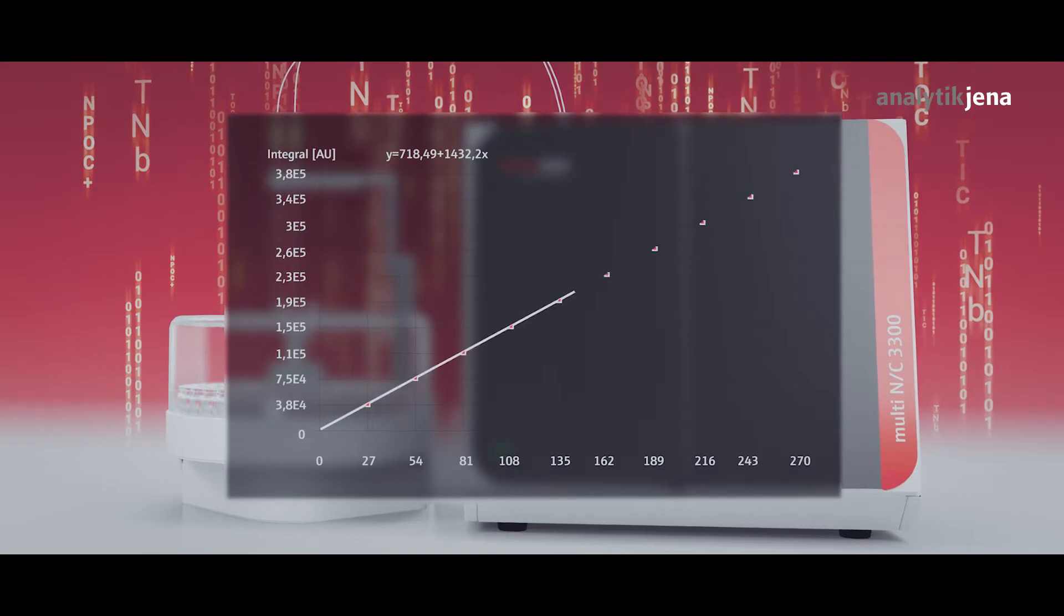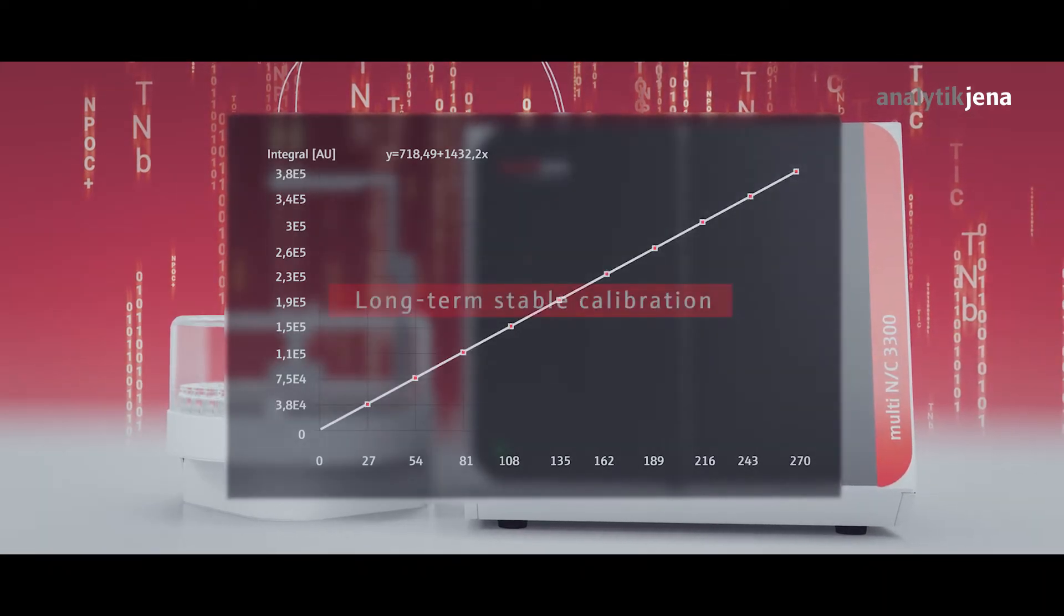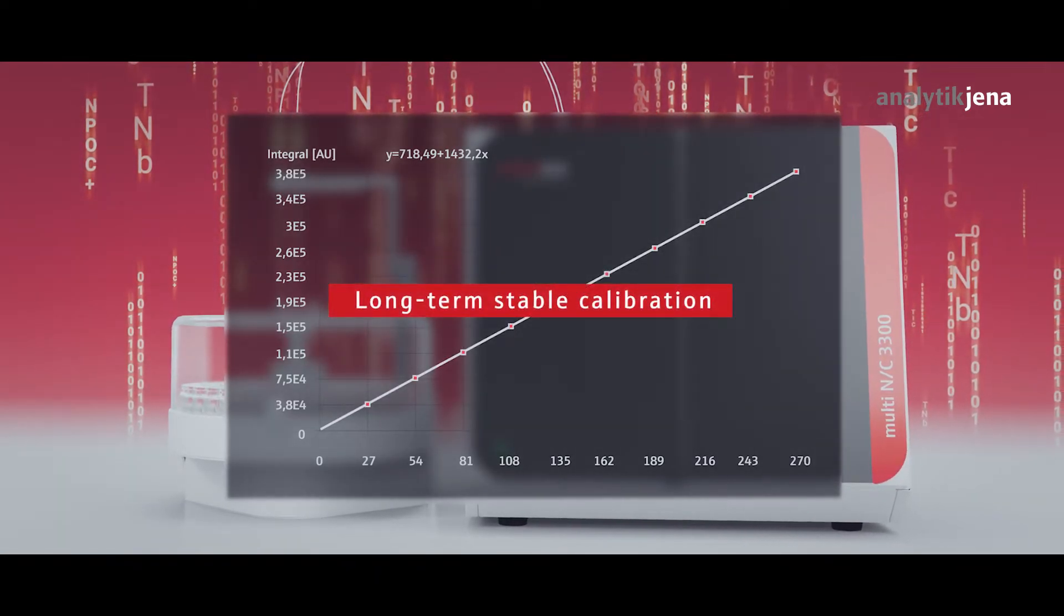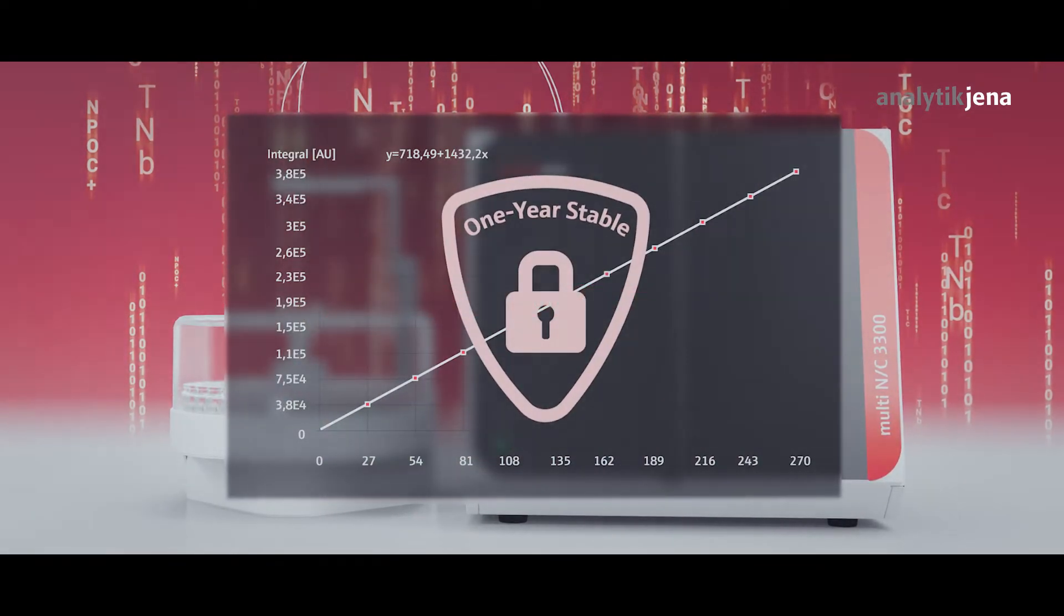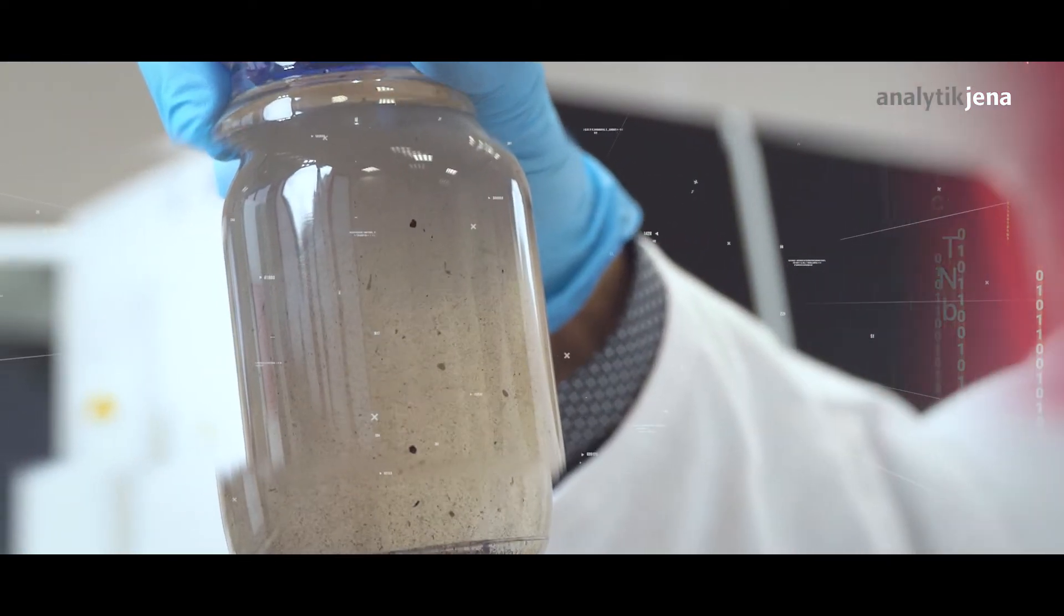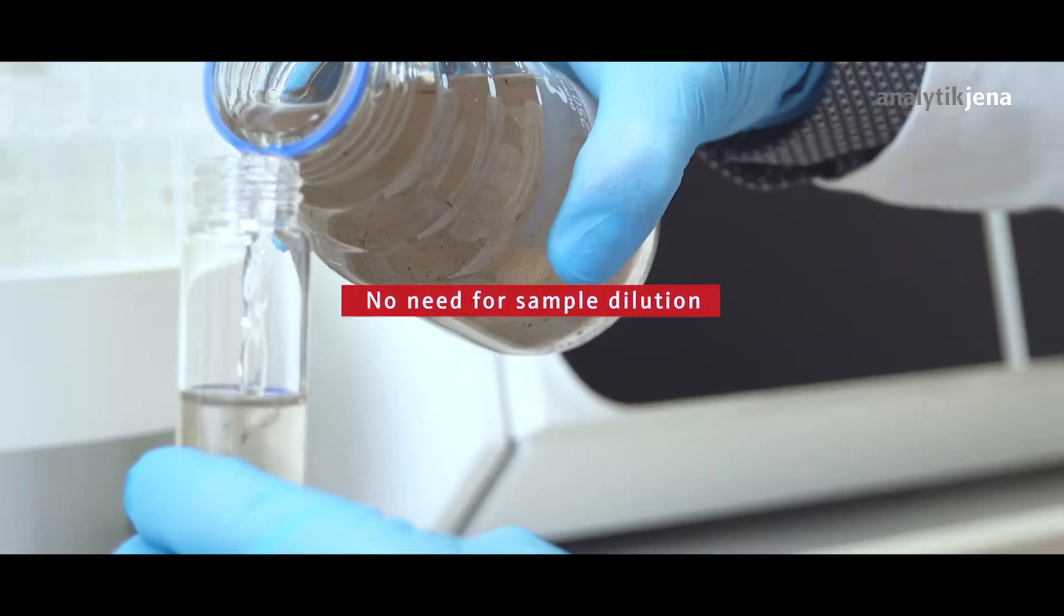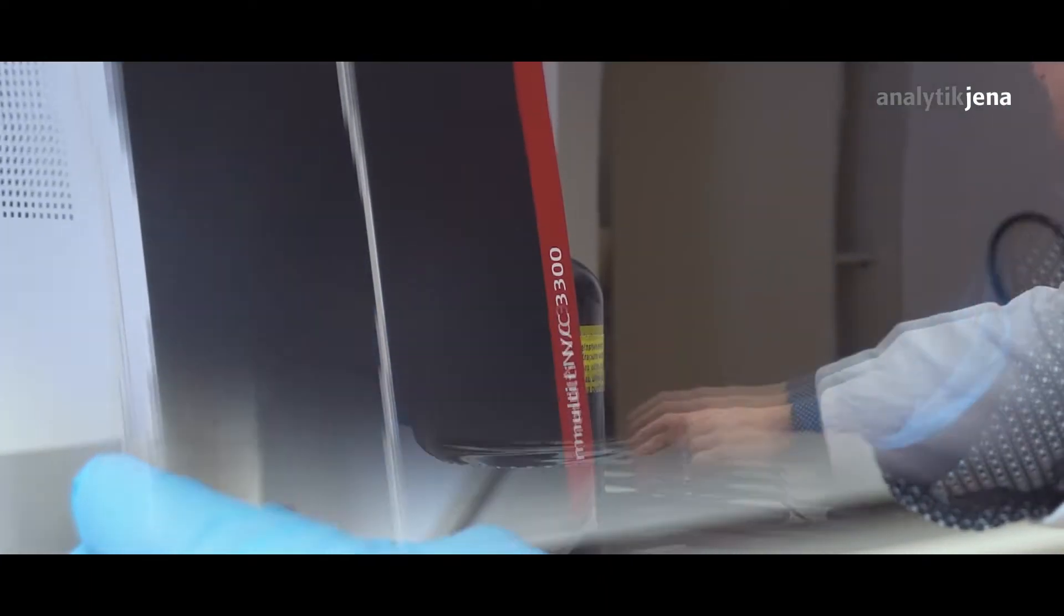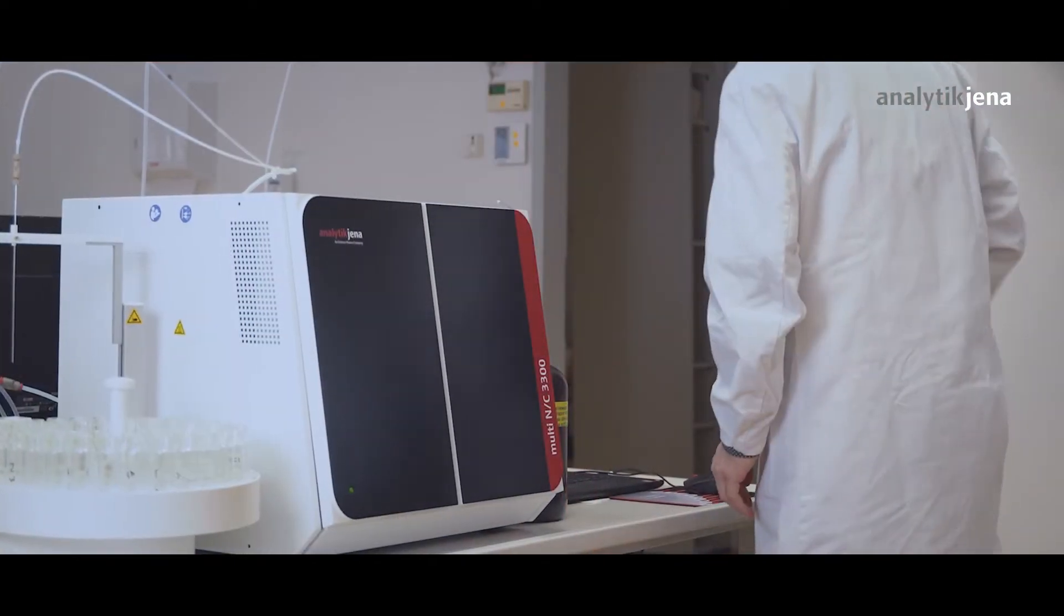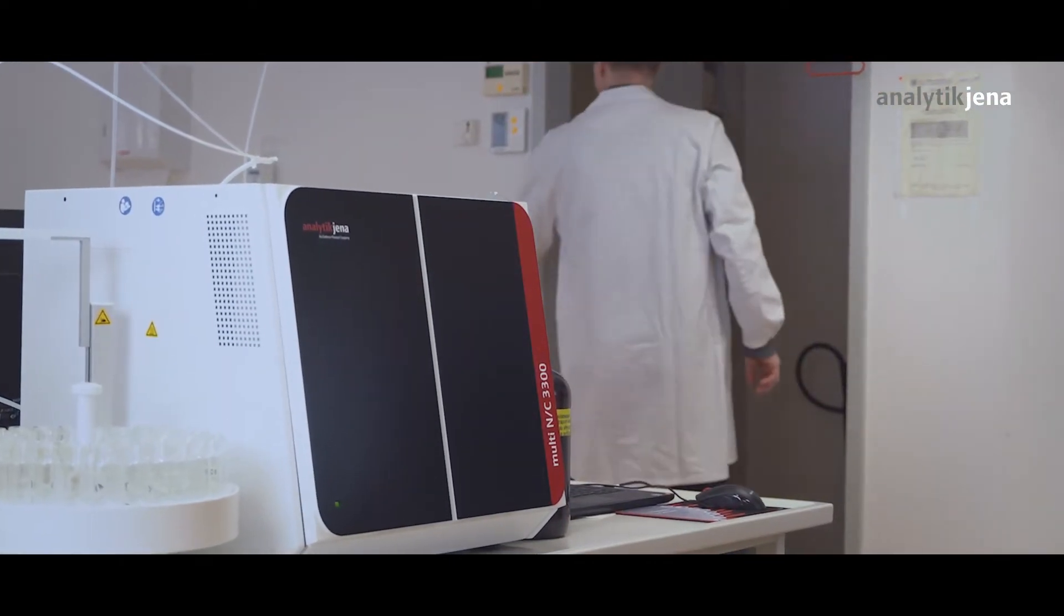Long-term stable calibration lasting up to one year. No need for the dilution of samples. Unattended operation with true peace of mind.